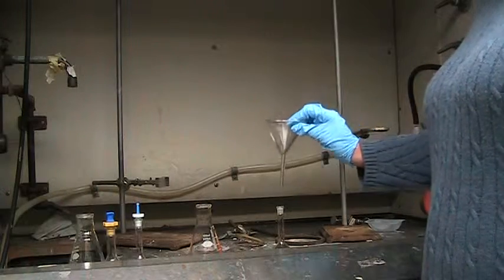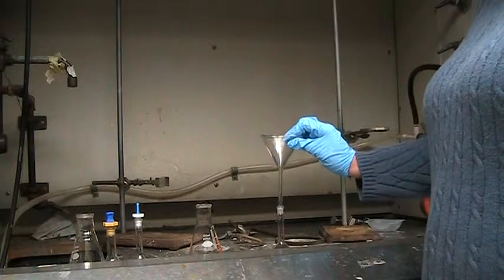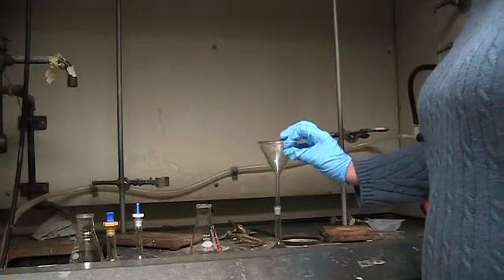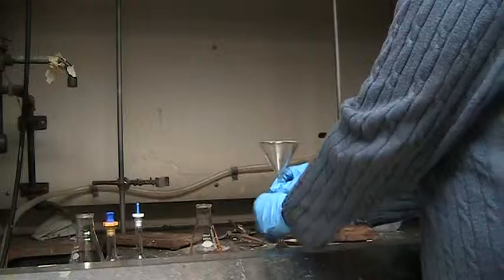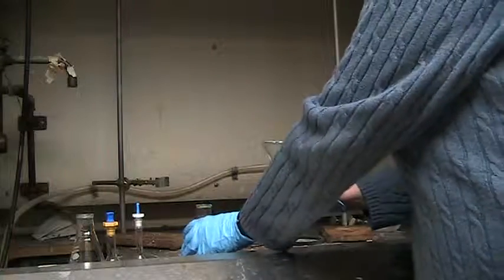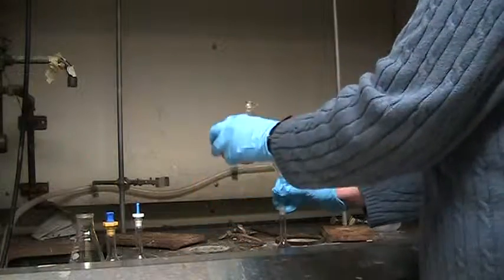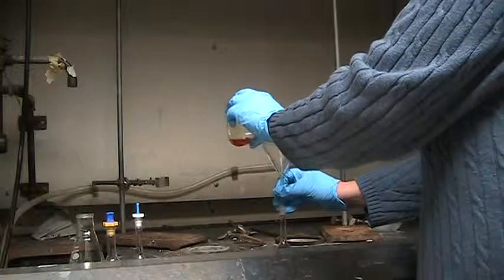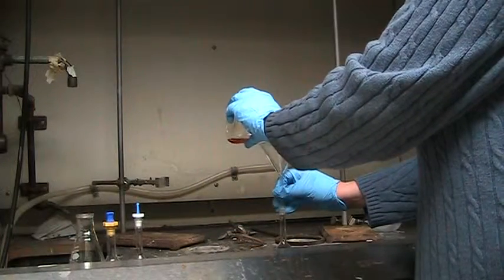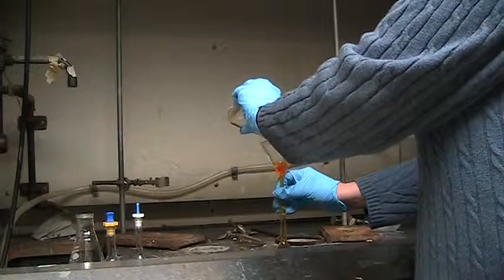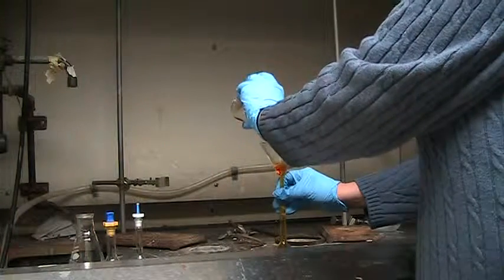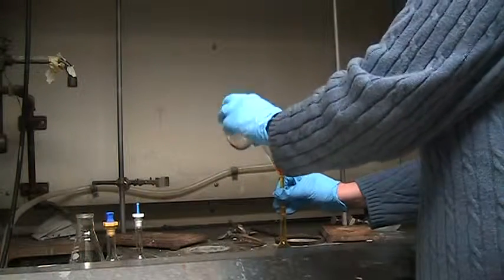In order to do that you want to use a funnel to transfer all of your solution to a volumetric flask. In this case I'm using a 25 mL volumetric flask.